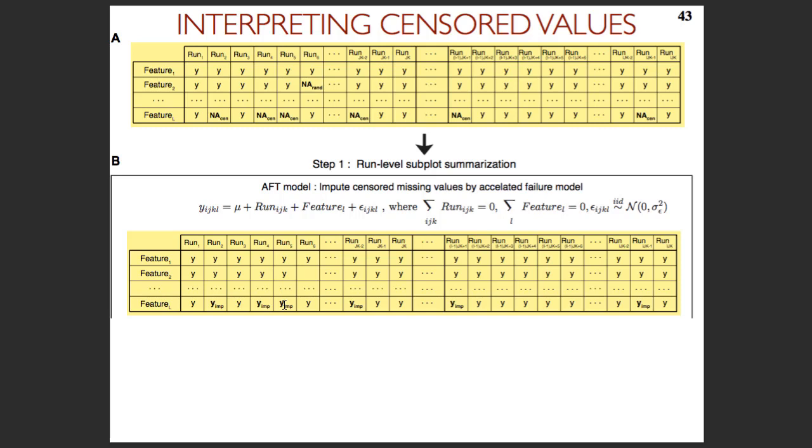So in principle, you don't even need to estimate these individual missing values. You can just get the mean here and the mean here based on the maximum likelihood. And this would work, except that maximum likelihood is not very resistant to outliers. And we have both problems: missing values and outliers. So our initial idea was, let's just do maximum likelihood and immediately infer the means and compare them. What we found was that when we have outliers, let's say even here, right? Then the maximum likelihood will not do very well.